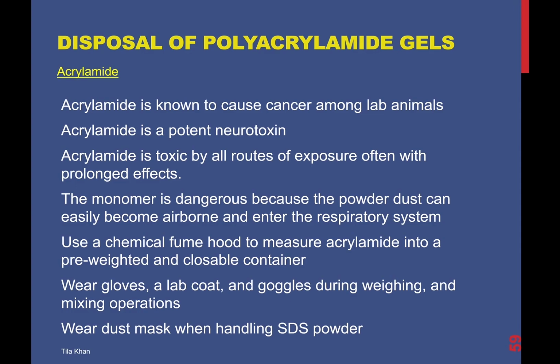So whenever you are handling acrylamide and making some solutions of bisacrylamide, use a chemical fume hood to measure acrylamide into pre-weighed and closable containers so that you are not exposed to this harmful chemical. And while you are doing all of these operations, please wear gloves, a lab coat and goggles. And when you are adding SDS powder, please wear a dust mask when you are handling SDS.